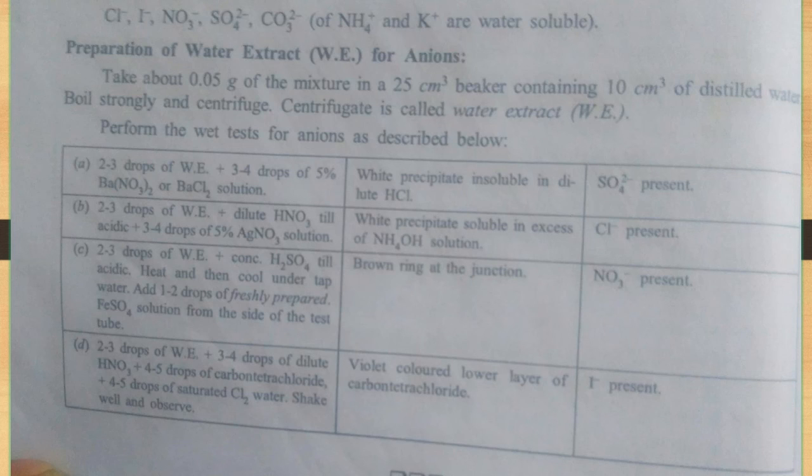After detection of one impurity cation, move to detection of anion. For that we will use the second part of the water extract. There are a total of 4 anions included in our syllabus: sulfate, chloride, nitrate and iodide ions.